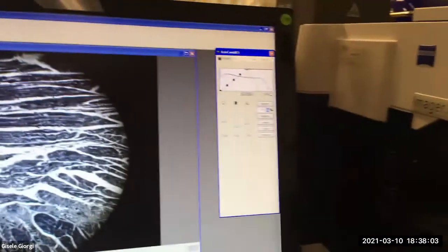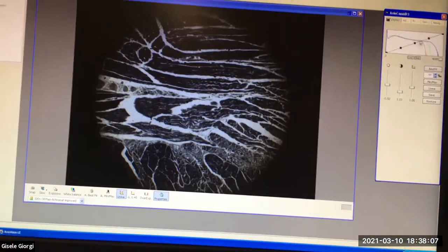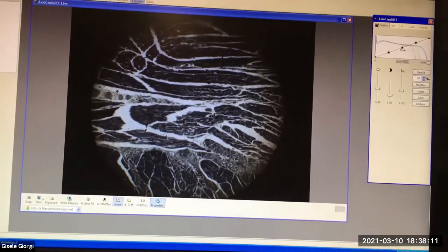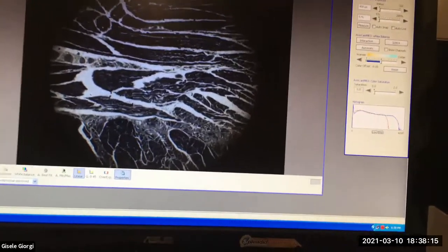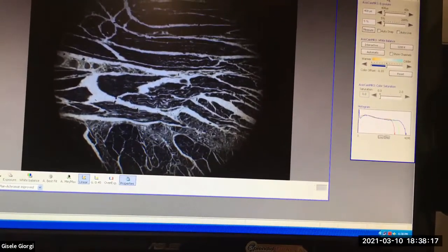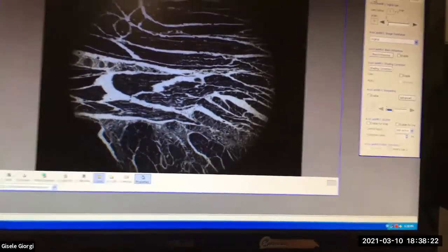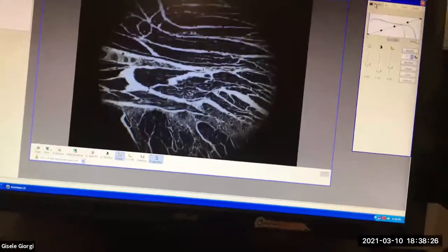Here's a contrast stretch. I hope you can see that. And this makes gamma really easy. Oh, no, it's not curving it. I take it back. This software is not very user-friendly. To do gamma, I'm gonna have to come in somewhere else. Okay, we'll save that for next week because I wanna come back to Koehlering.